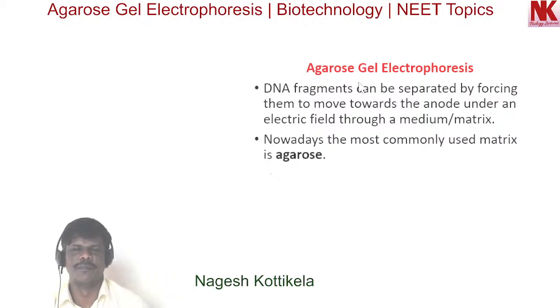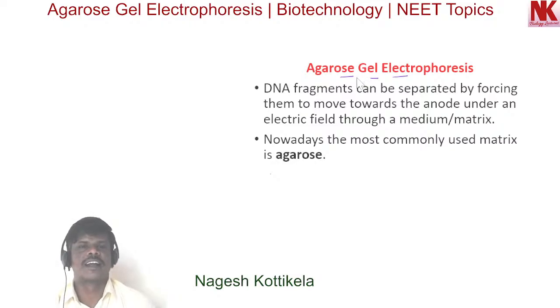Hey guys, welcome back. Today's topic is Agarose Gel Electrophoresis. This is from Biotechnology from class 12 biology. Here, DNA fragments can be separated by using this Agarose Gel Electrophoresis.